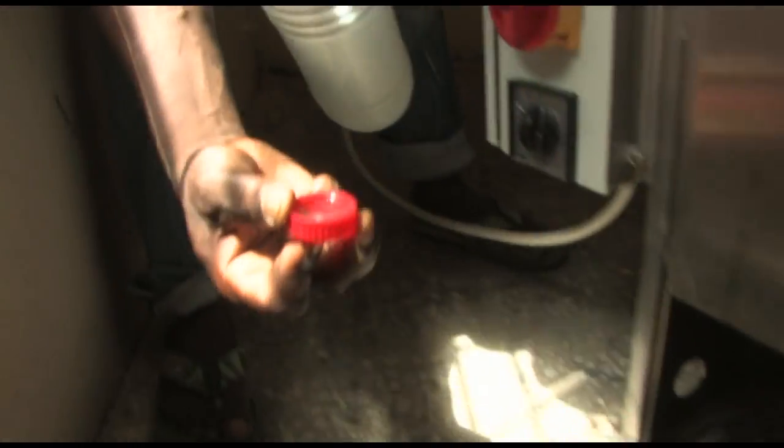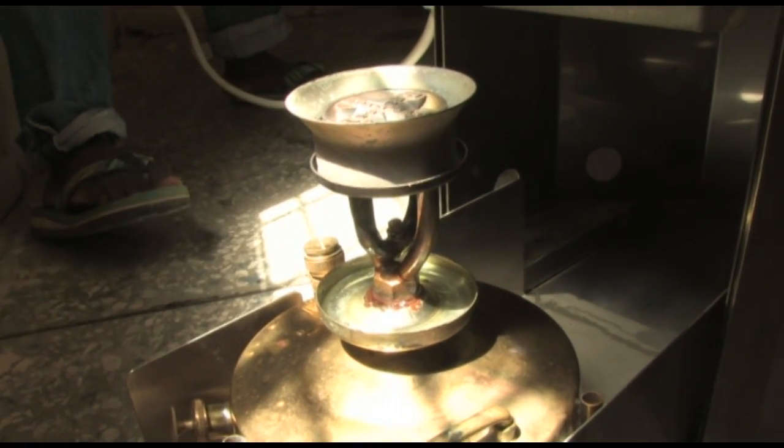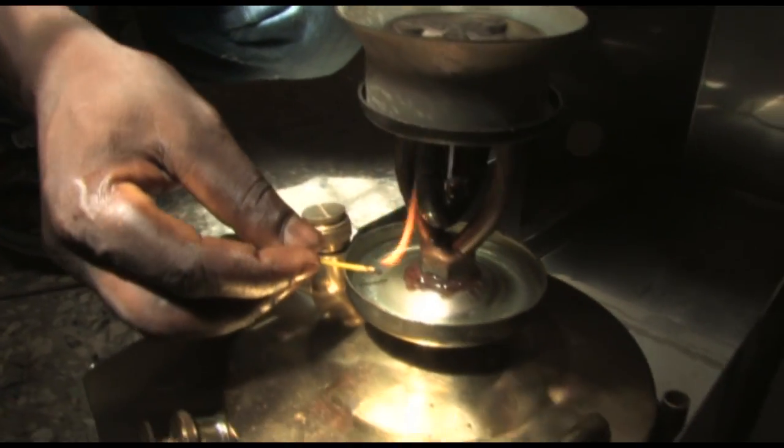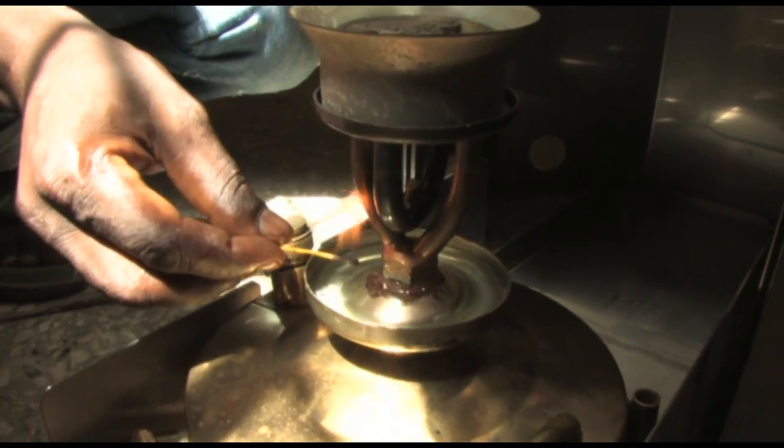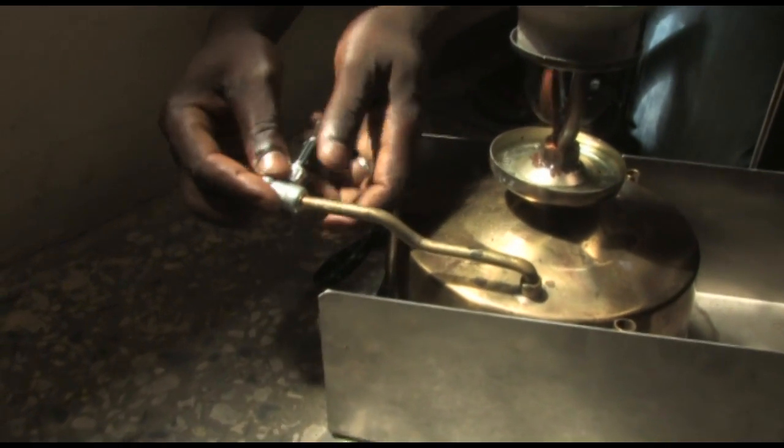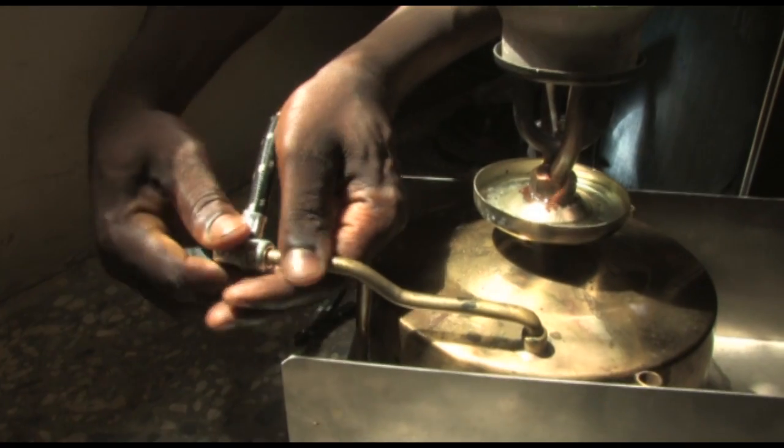Fill the preheater cup with methylated spirit or alcohol. Light the preheater. Now leave the burner alone. Do not fiddle with it. If you have not already done so, connect the tube of the foot pump to the air valve on the burner.